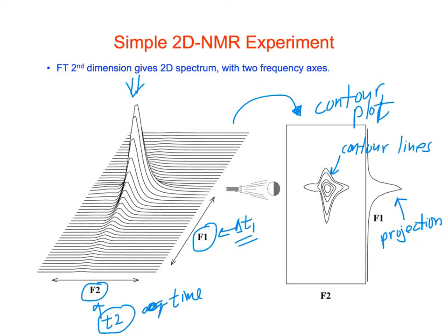And it essentially would be what we would see if we had the cursor running right through the tip of that peak. Okay, everybody with me?